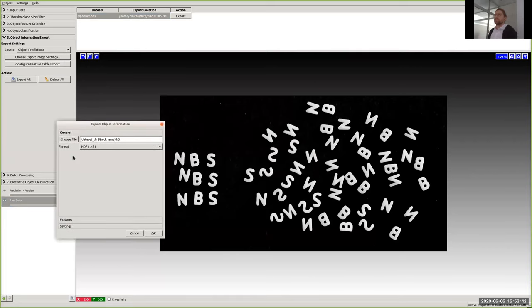What can you do with such a table? If you can do a little bit of scripting, you can generate a quality control PDF directly from the results, where you have your object, the object mask, the predicted label, and you see the probability and whether you labeled it or not. These kinds of things can be really nice in your daily work for quality control and quality assurance.